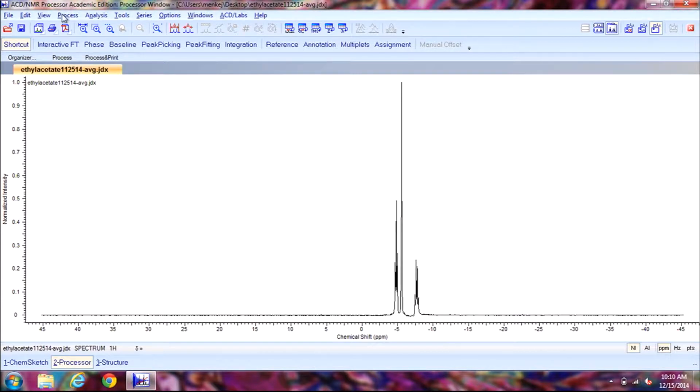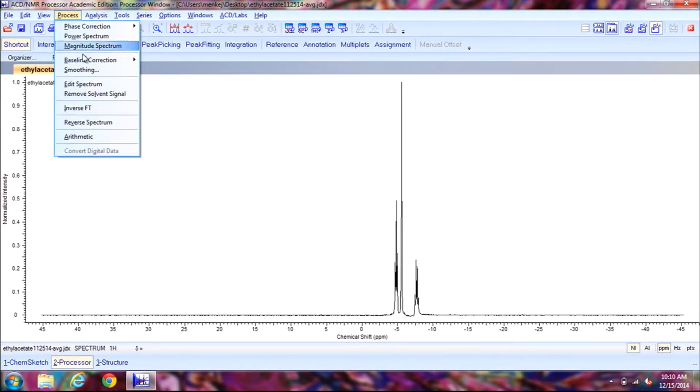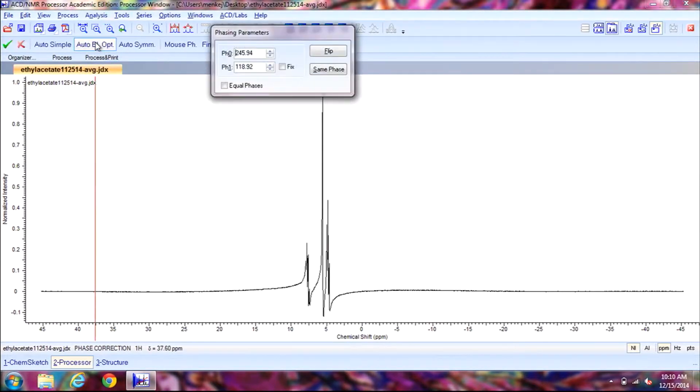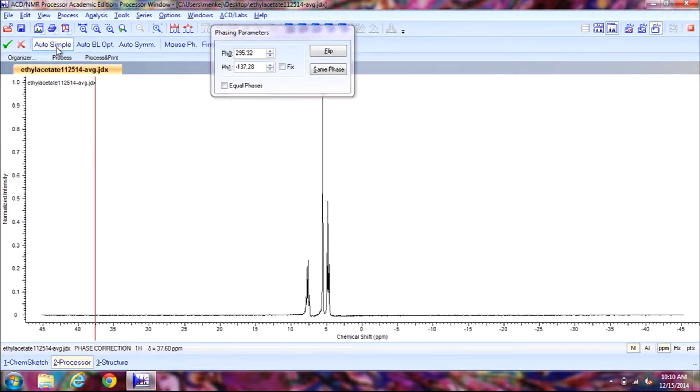Next click on process and then go down and select reverse spectrum. Now we're going to click on phase and then move over to click on auto simple. And then just click on the green check mark to exit out.